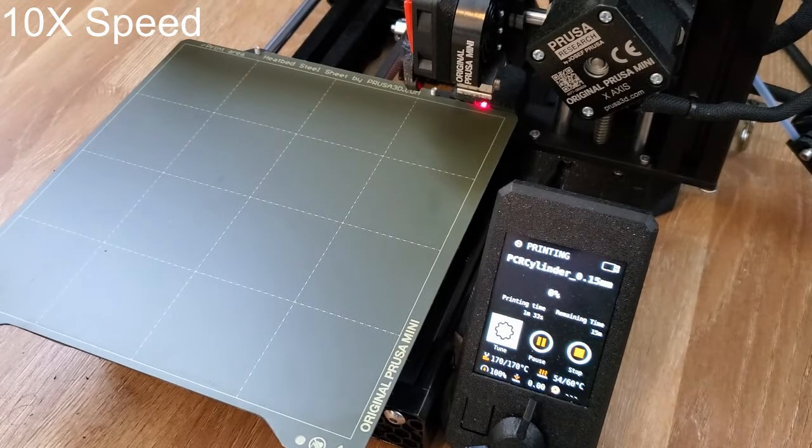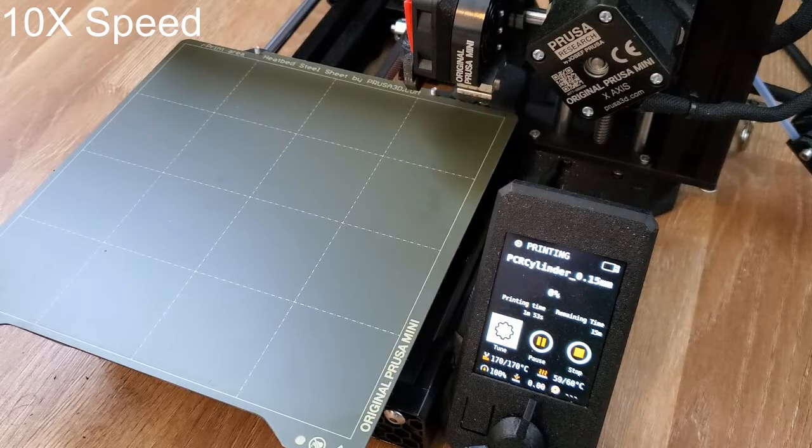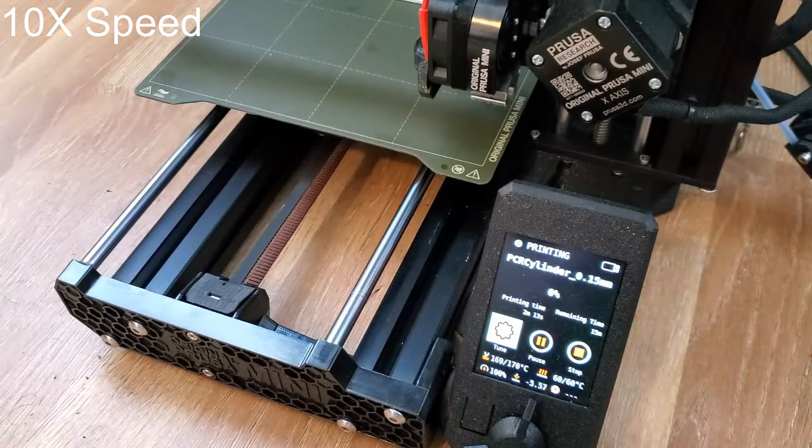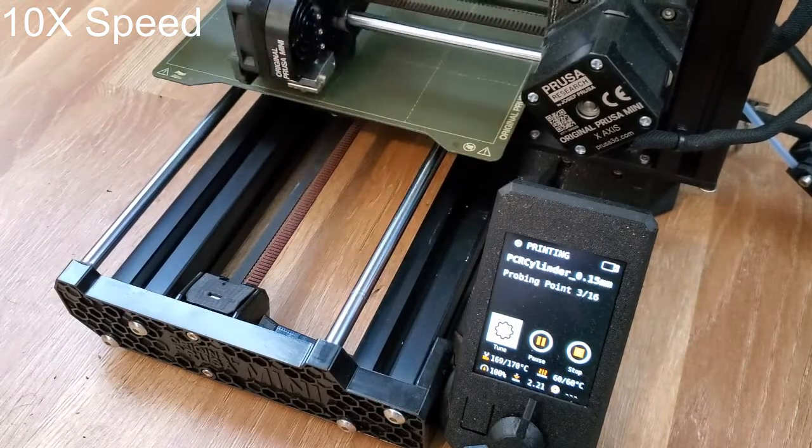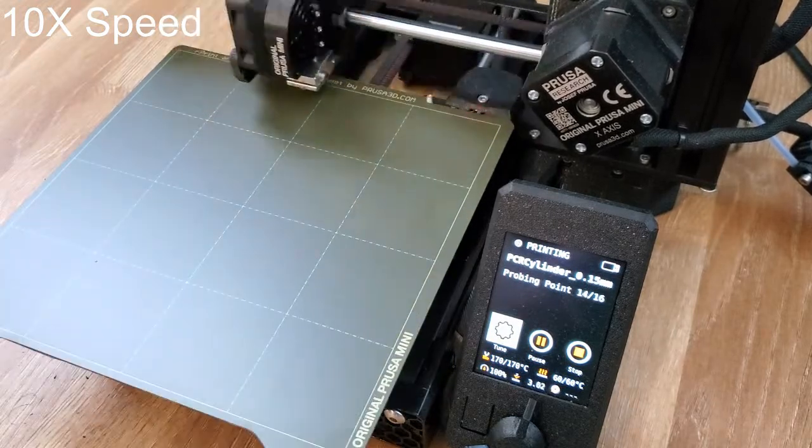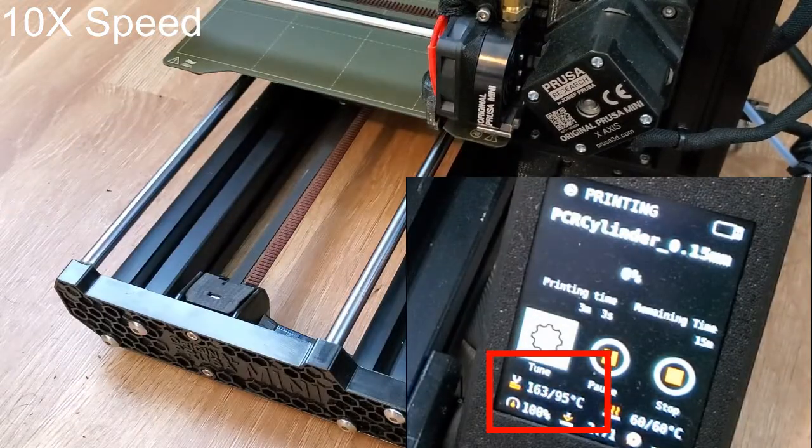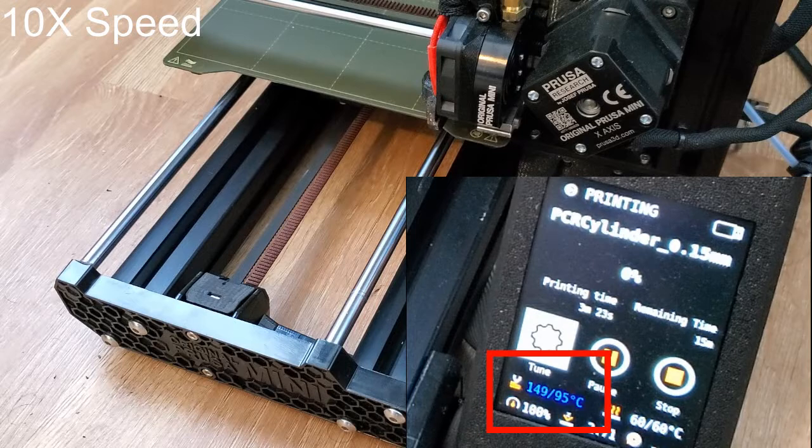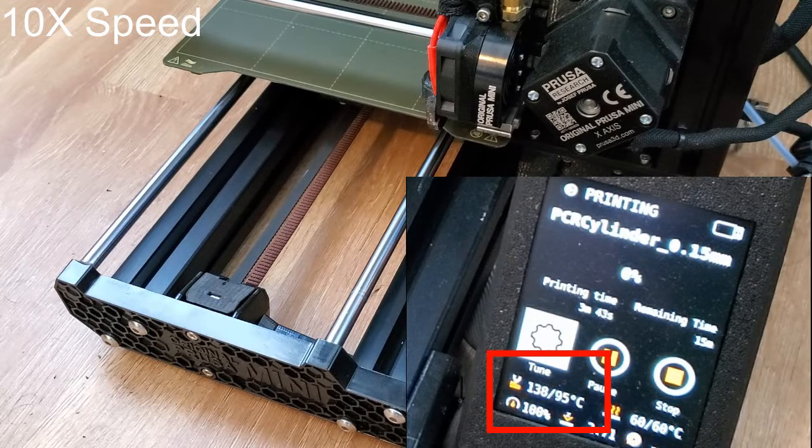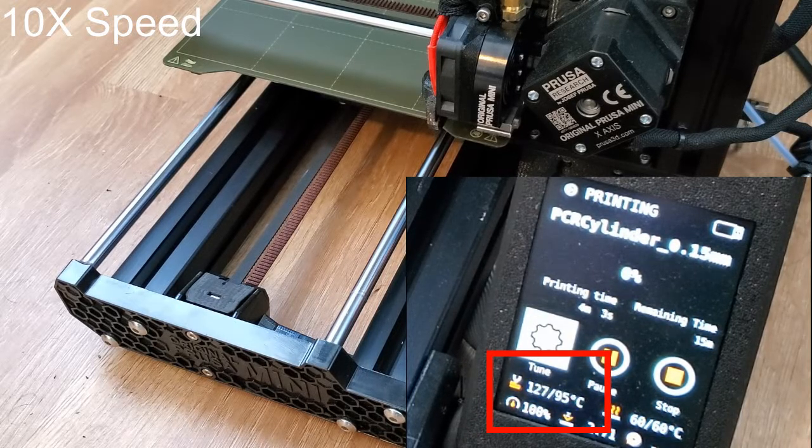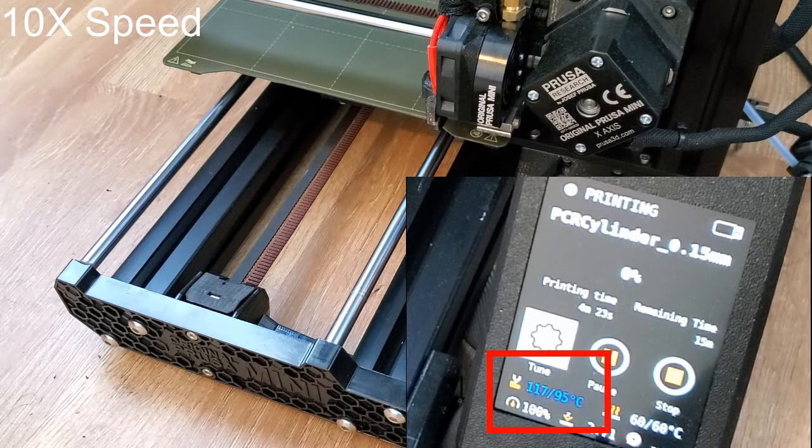While I was experimenting with optimizing settings, I came across the concept of a temperature tower, which is meant to optimize the hotend printing temperature by changing the temperature of the hotend in specific increments at different z-heights. You can then see which block looks best, and the hotend temperature can be modified accordingly for future prints.